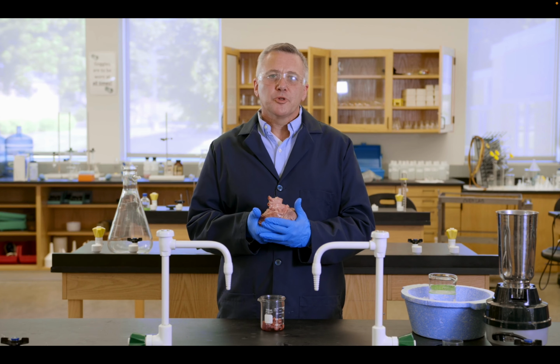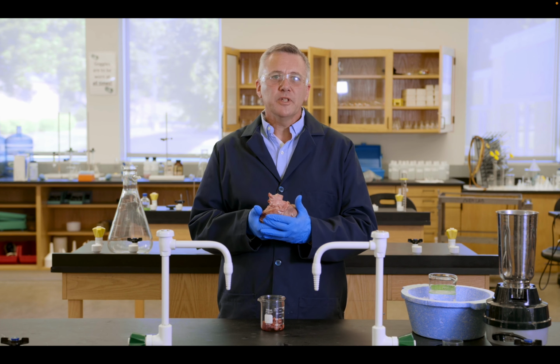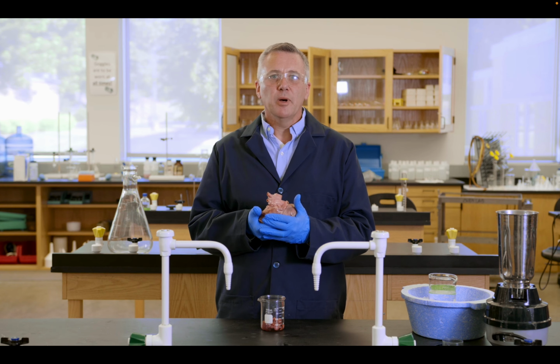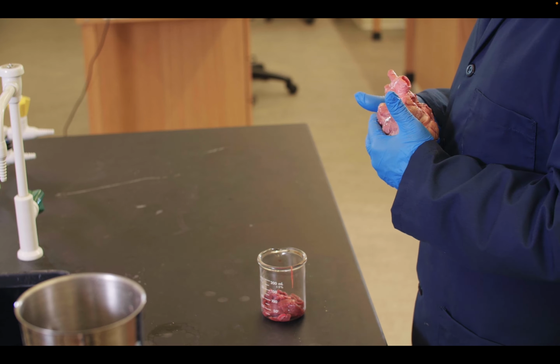So as we begin this procedure, one of the things we did is we actually did have a pig heart, and from the pig heart we got one of these from a slaughterhouse, and of course this is a smaller one, so we actually dissected. So you can see here what's remaining. But the meat of the pig heart has already been cut up, and there's some of it in the beaker right below. We're next going to continue with the pig heart to actually isolate an enzyme from it, the GOT enzyme.